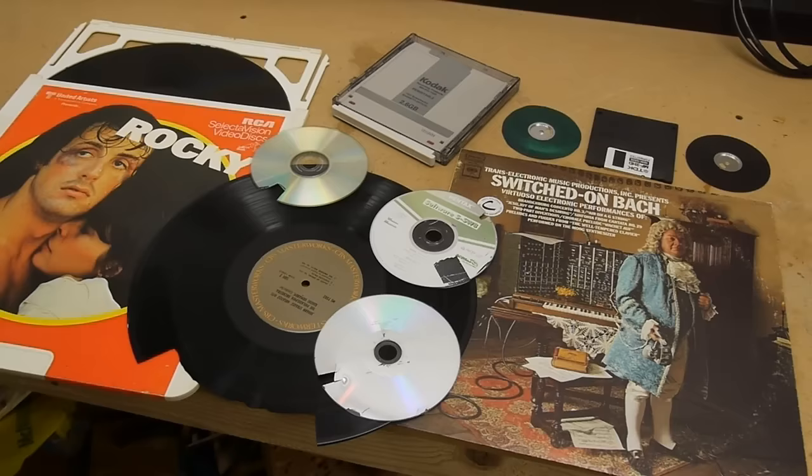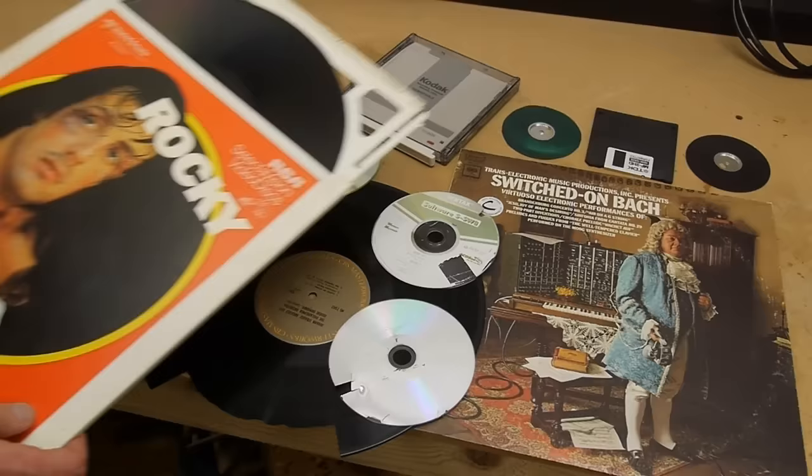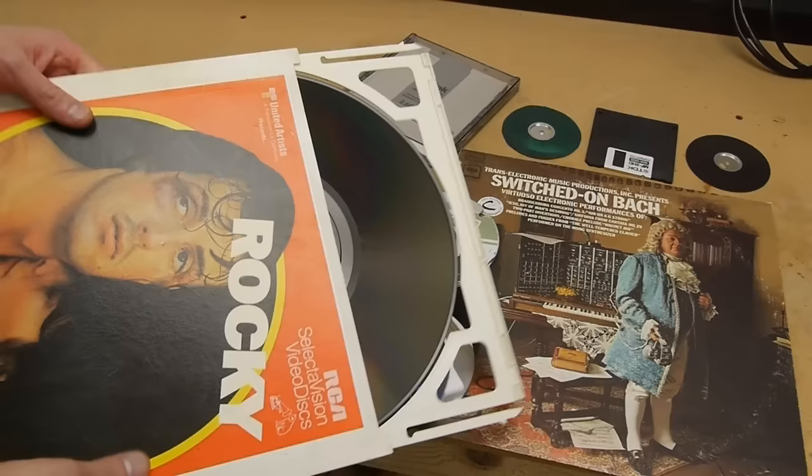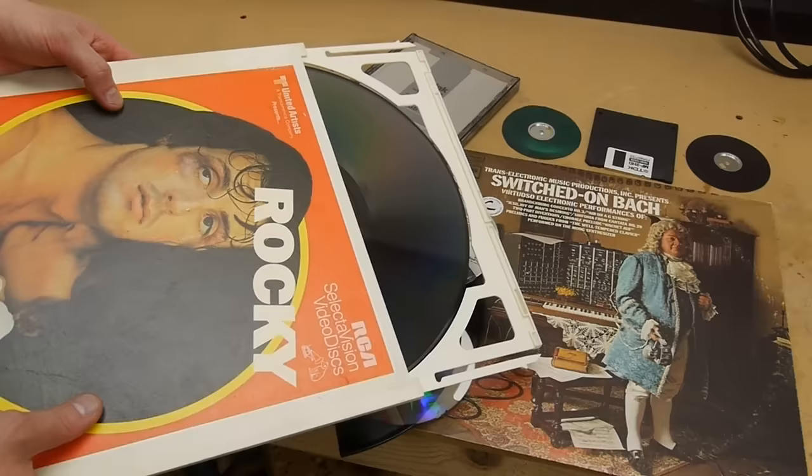So then I thought, well this is cool, maybe there's some other interesting recording formats I can take a look at. Just in the last week or two, my friends at Evil Mad Scientist Laboratories reminded me or showed me this for the first time. This is a capacitance electronic disk, a very unusual video format that was developed by RCA but was sort of a commercial failure.